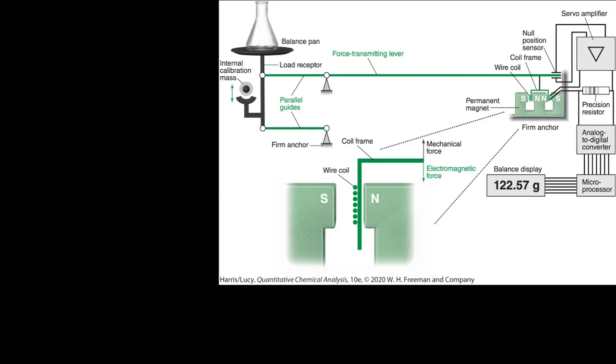One of the neat things about it is that most of these balances now come with an internal calibration mass built in. So they actually calibrate themselves. You can hear them. Maybe once an hour, you'll hear a click and a whir as the balance weight is placed on here, and the instrument checks that the calibration mass is exactly equal to the mass measured. Otherwise, it makes a correction factor. So these do this once an hour if they detect a temperature change in the lab or whatever time parameters you've set to it.